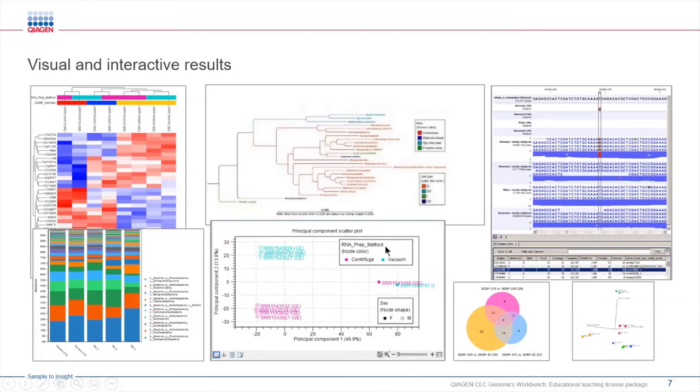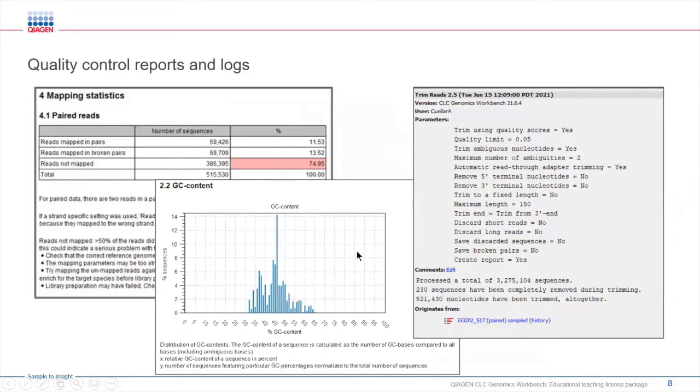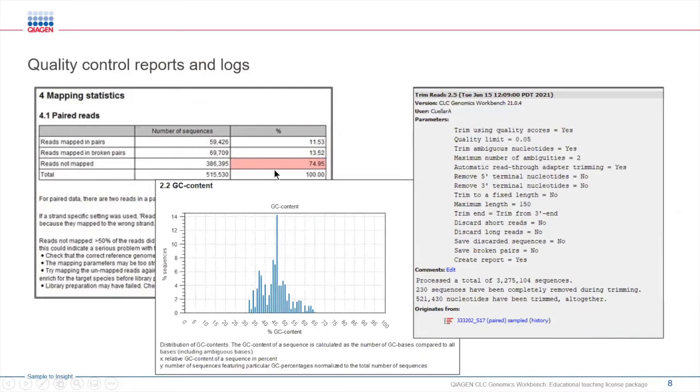In addition to generating these outputs, one of the things that makes CLC special is that it will do additional things that are very beneficial to users like you, such as generating QC reports. If you map reads to reference, for example, CLC will generate a QC report.